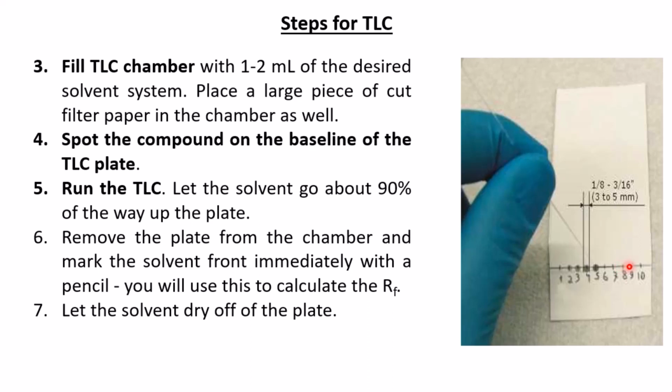And you make sure they are spacious enough, just so you don't end up having some of the spots dissolving into the next spot. So you get your TLC chamber, you saturate it, or you add your desired solvent system into the TLC chamber, and then you add a filter paper to the chamber, and then you cover it. And the purpose of the filter paper is to saturate the chamber with your solvent system, right? Then you go ahead and spot your components on the baseline.